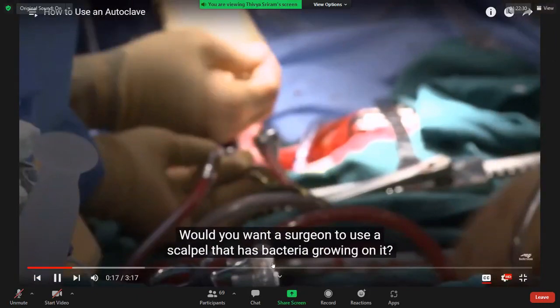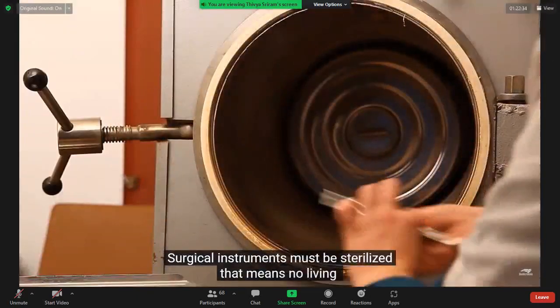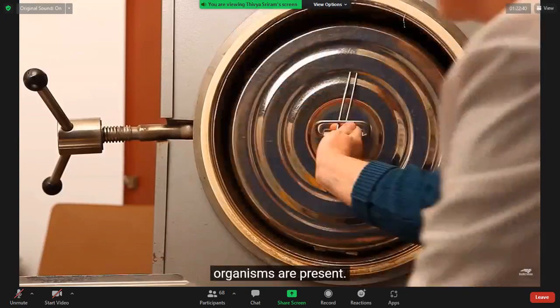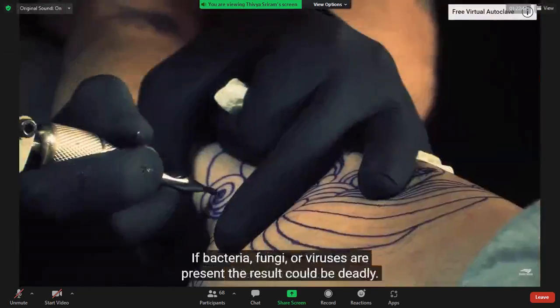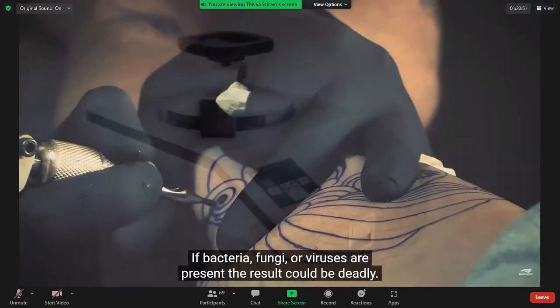It has bacteria growing on it? Of course not. Surgical instruments must be sterilized. That means no living organisms are present. There are lots of products that need to be sterilized: pharmaceuticals, equipment, solutions, medical waste, even tattoo needles. If bacteria, fungi, or viruses are present, the result could be deadly.